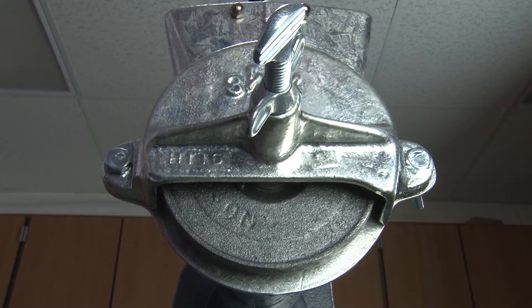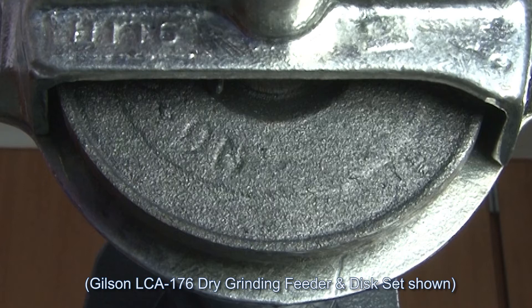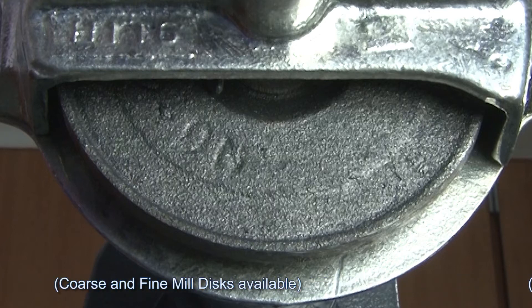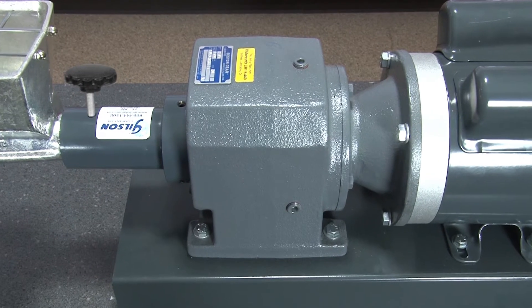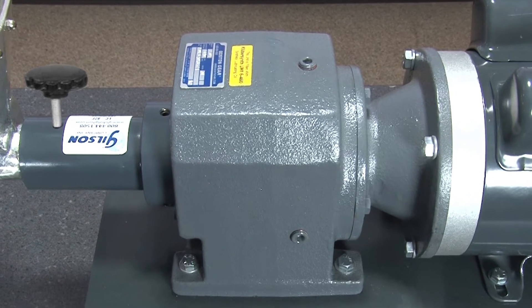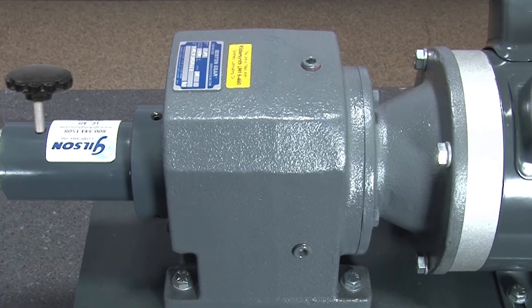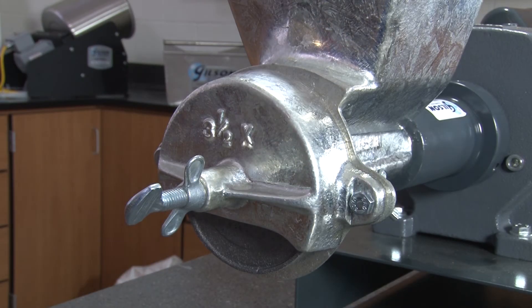This rugged mill's 4-inch grinding plates are made of a hard iron alloy designed for clog resistance and a long service life. And the oil-filled gearbox features a replaceable safety coupling to prevent overload damage. Plate-to-plate clearance is easily adjusted by hand.